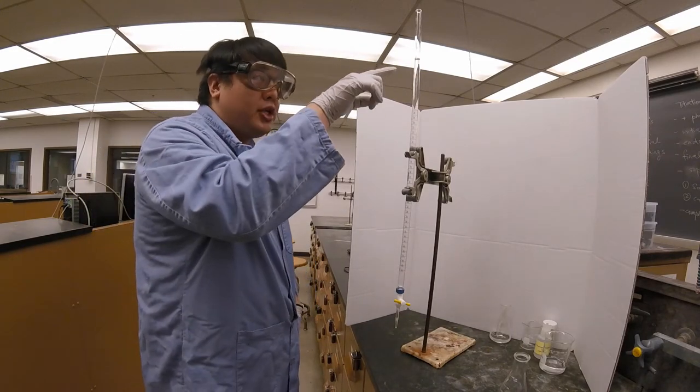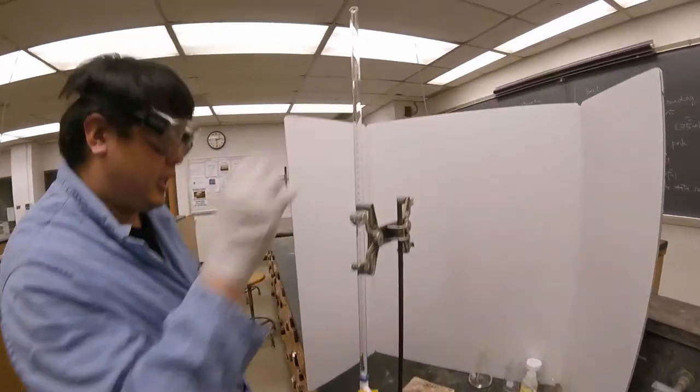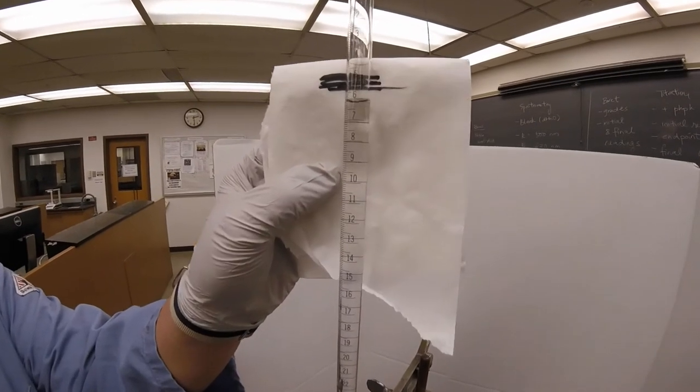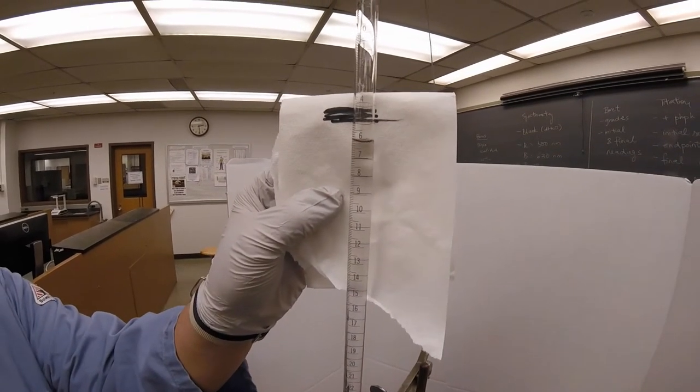Now the major tick lines, you can see identified with the numbers over here, but the minor tick lines, you'll notice that there are 10 in between each major tick line.